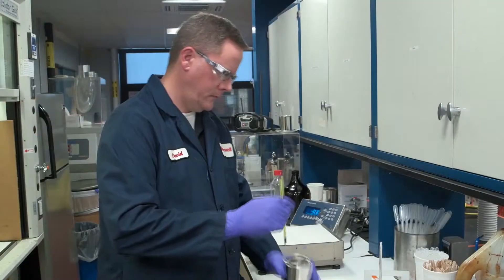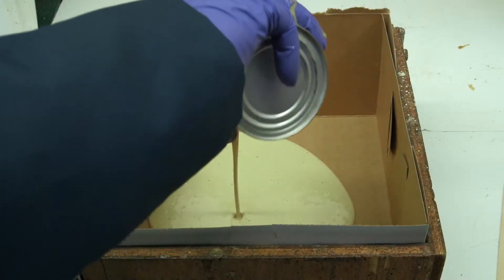Today we're going to demonstrate how we prepare a hand mix of polyurethane foam. The process is used to prepare foam for properties testing.